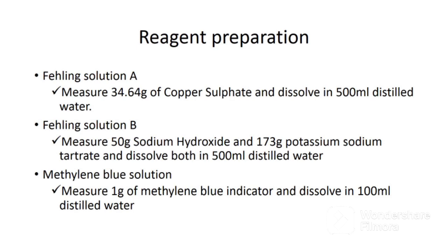The next reagent to prepare is Fehling Solution B, which contains sodium hydroxide and potassium sodium tartrate. To prepare it, measure 50 grams of sodium hydroxide and 173 grams of potassium sodium tartrate and put them in a 500 ml volumetric flask. Add a small amount of water and shake to dissolve all the crystals, then top up to the mark with distilled water.